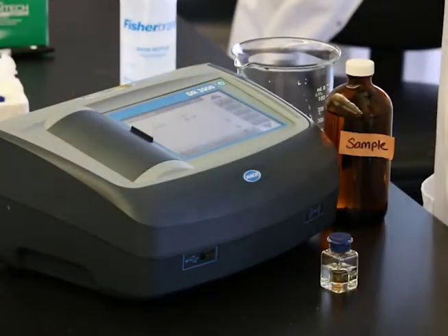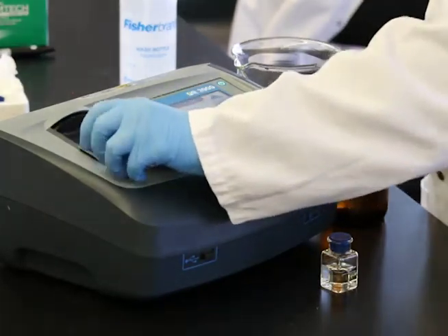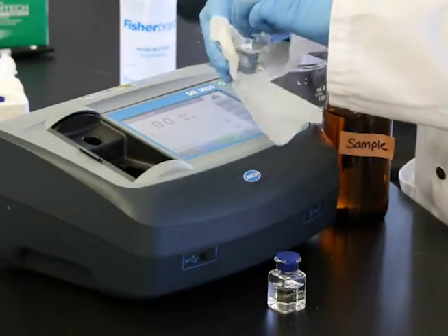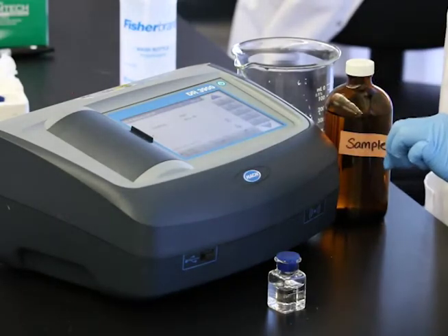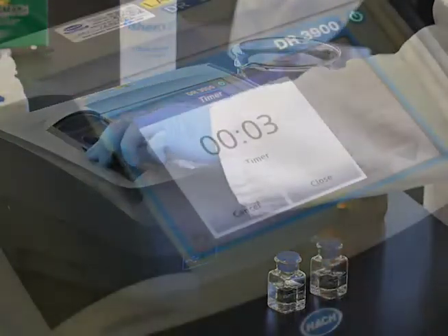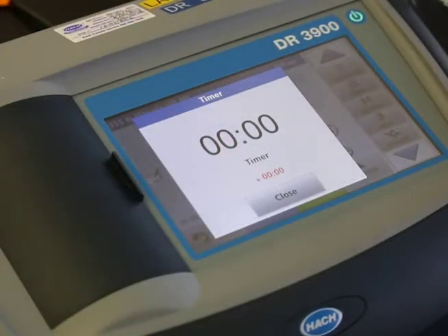Clean the blank cell and insert it into the instrument. Zero the instrument. Remove the cell and then clean and insert the sample cell once the timer has expired. You must read this cell within one minute of the timer expiring.